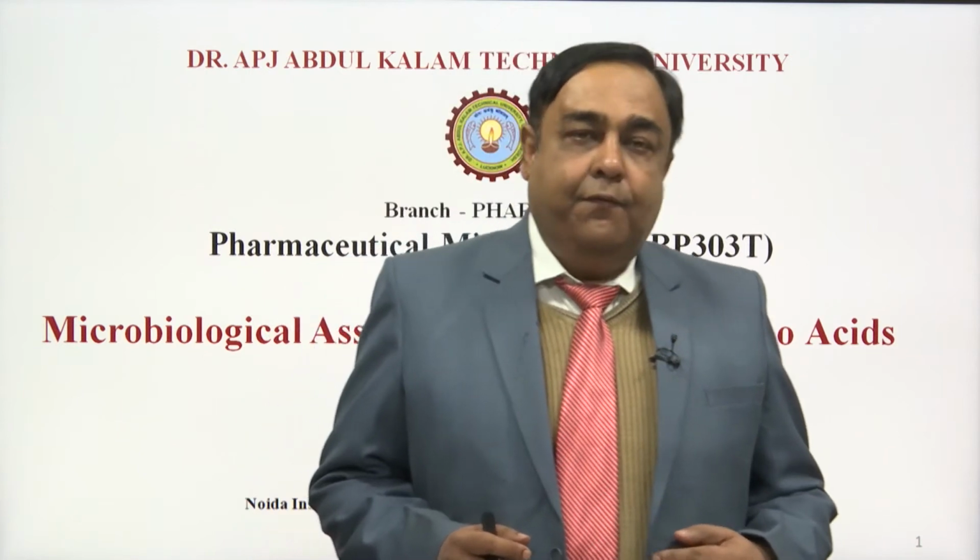This subject is covered across the country as recommended by the Pharmacy Council of India, and in our university also you are studying this subject. Now, today my class will be mainly covering the microbiological assay of vitamins and amino acids.